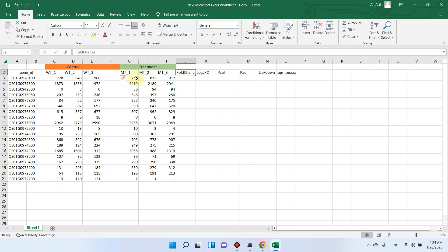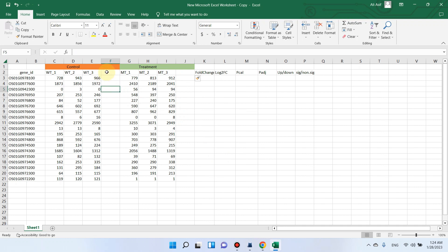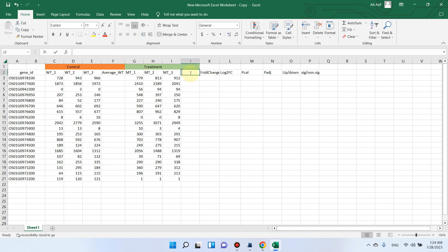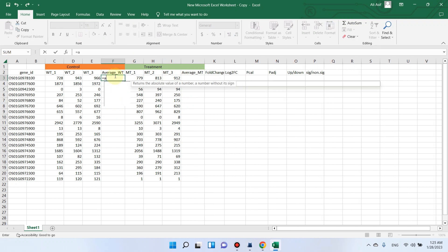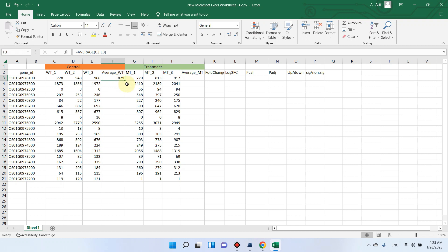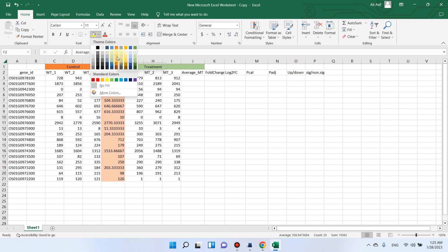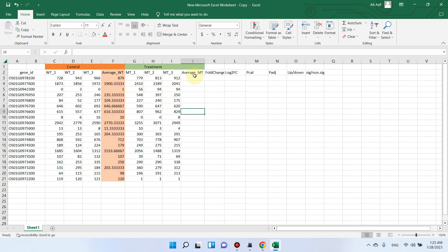Similarly, we can also insert one column after mutant type. Now you can see the column is inserted. We will take the average of control and treatment. Here we can write the AVERAGE formula — this is the average of wild type. We will select these three values for which we need to calculate the average. You can simply double-click on the dot and it will automatically calculate the average for all rows. We can highlight wild type with any color.